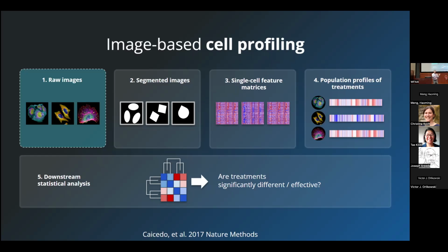So we take every single cell and we compute a bunch of properties or characteristics that define things like cell size and also the amount of colors that the cell has or the textures and so on. Many other properties that we can observe in the cells are collected in these matrices. So we can manipulate the data and then we can do treatment analysis.